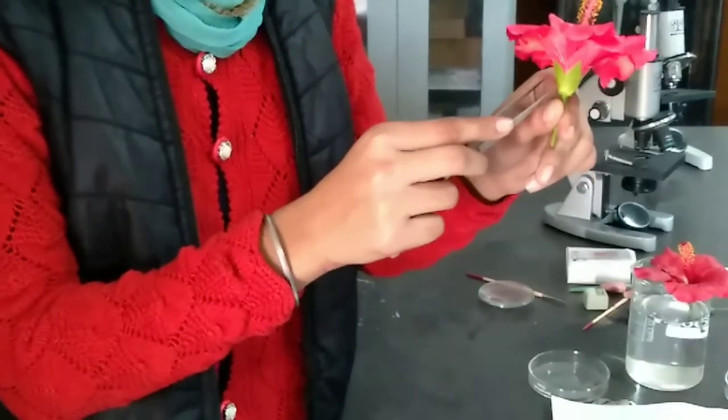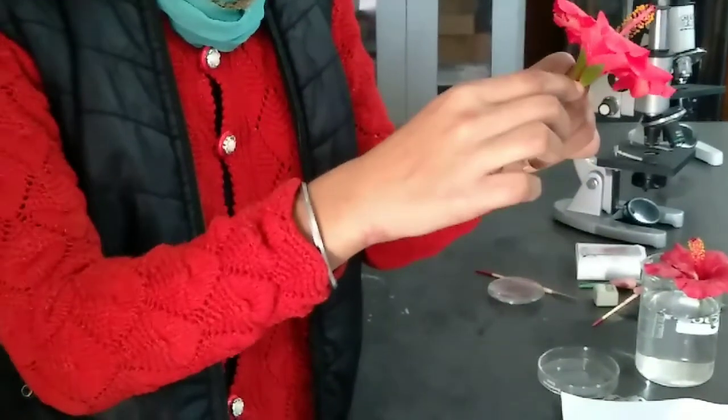Now this one is the calyx. There are five. Now we are going to remove this one here also.